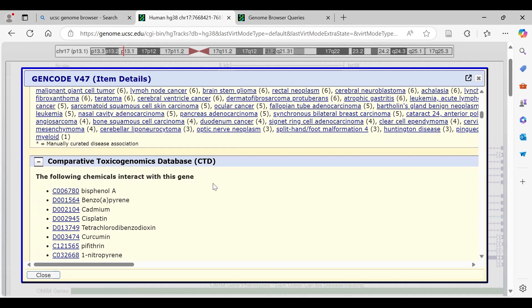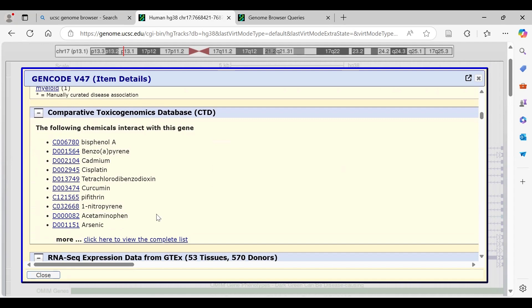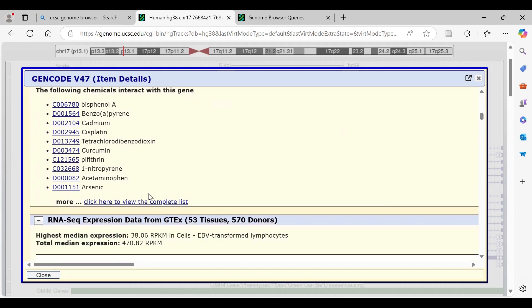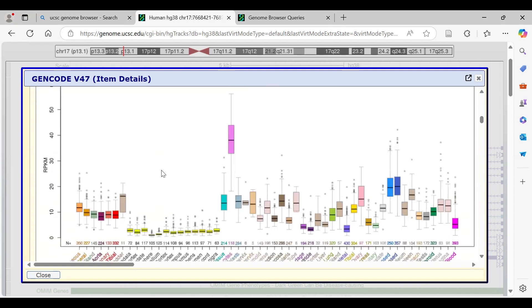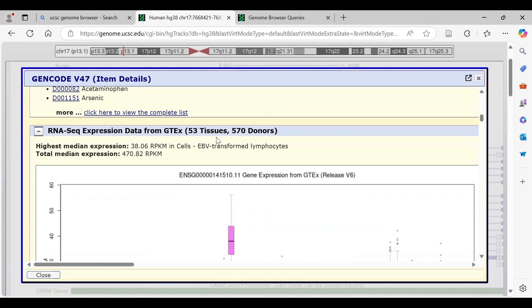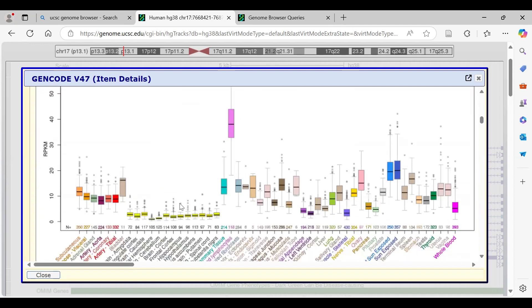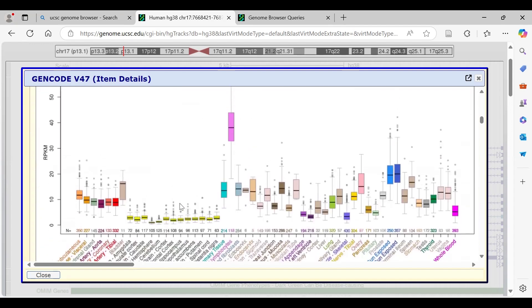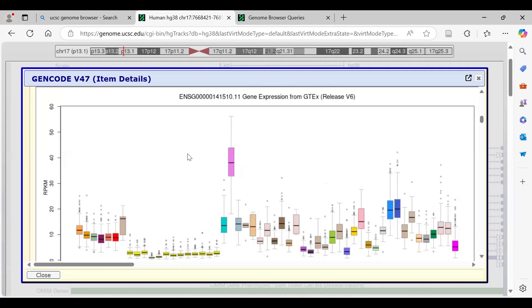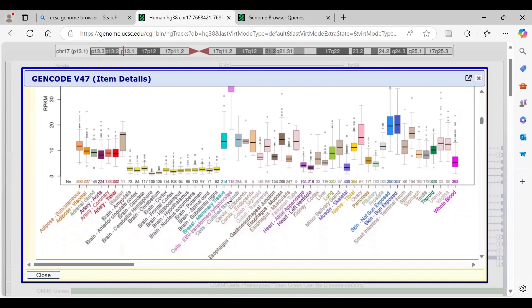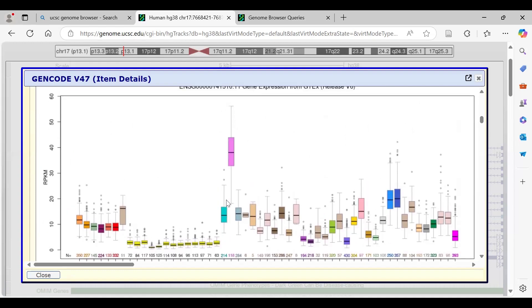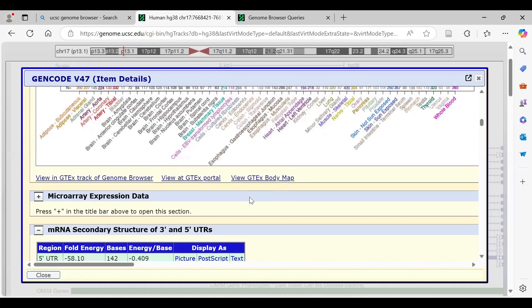We also have a toxicogenomics database here. You can click 'more' to get a complete list. RNA expression data from GTEx is available covering 53 tissues from 570 donors, showing which tissue has the highest expression of this gene — we can see it is highest in transformed lymphocytes.